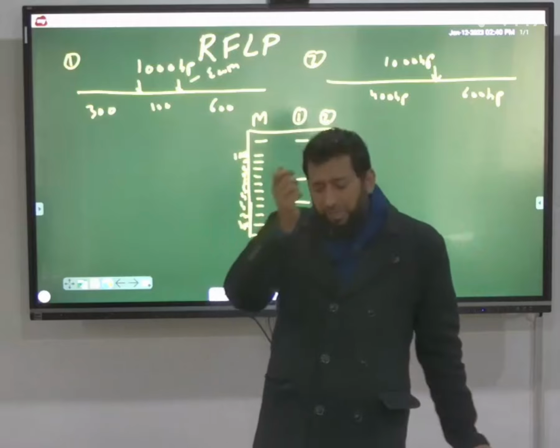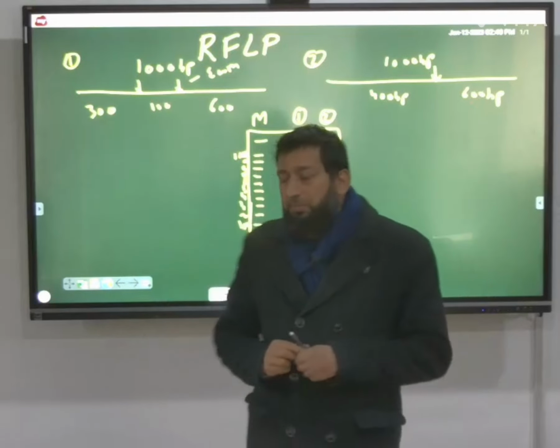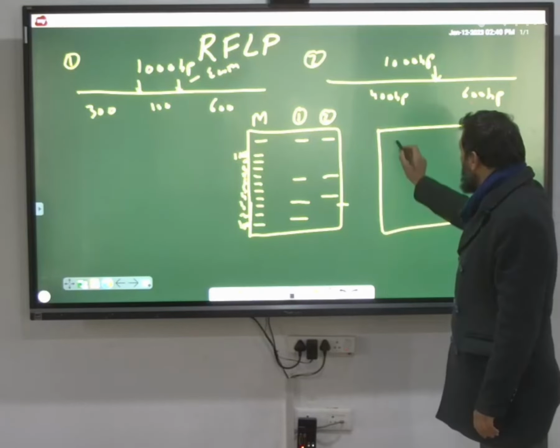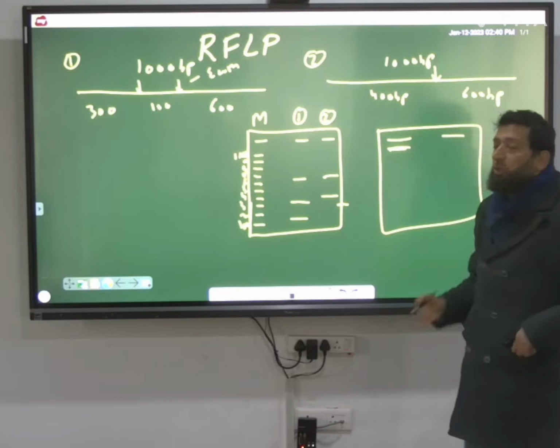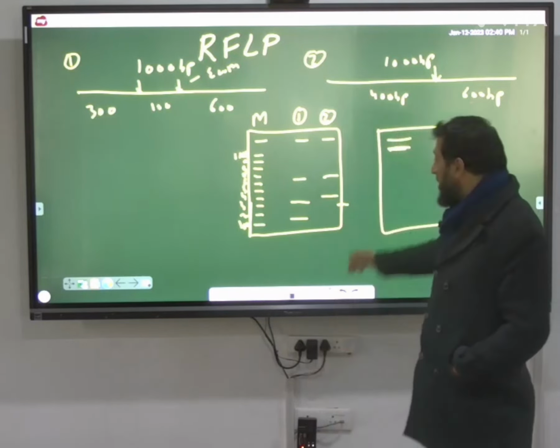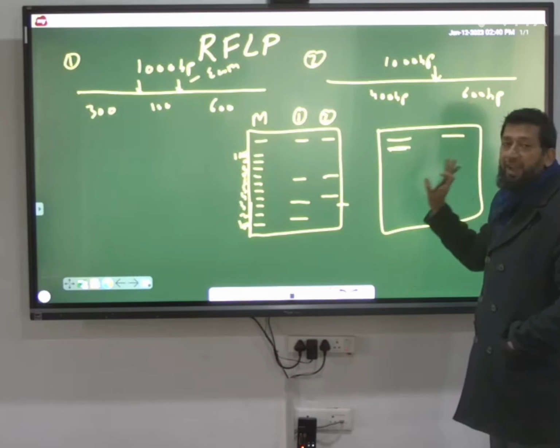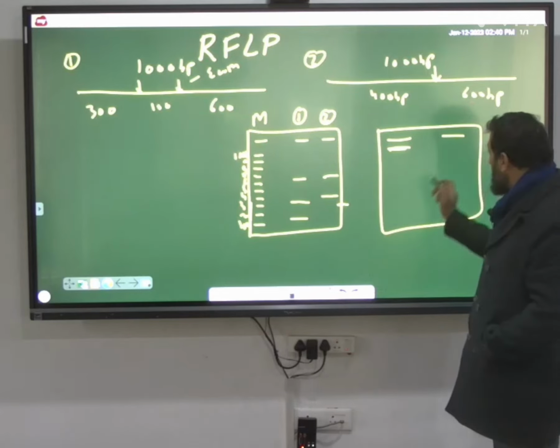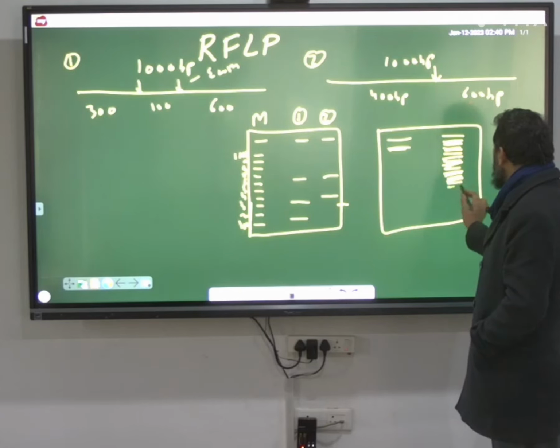However, in reality, this does not happen. Why does this not happen? Because if you take the genomic DNA from any organism and run it on a gel, it will give one band next to the well, because genomic DNA is very heavy. It will not move further in the gel. It will be stuck near the well. However, when you restriction digest any DNA with EcoR1, you will get a smear. Smear means you will get fragments of all sizes.